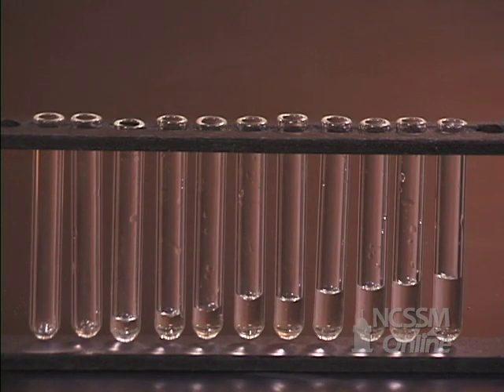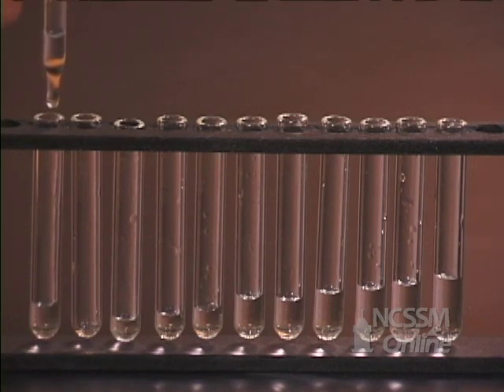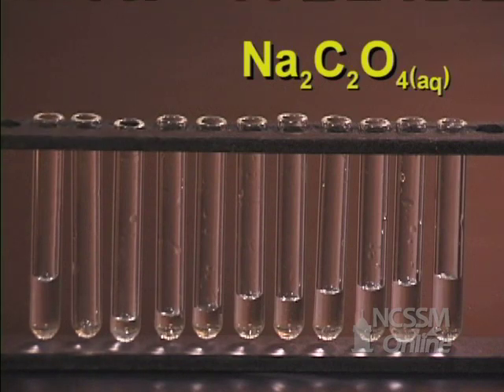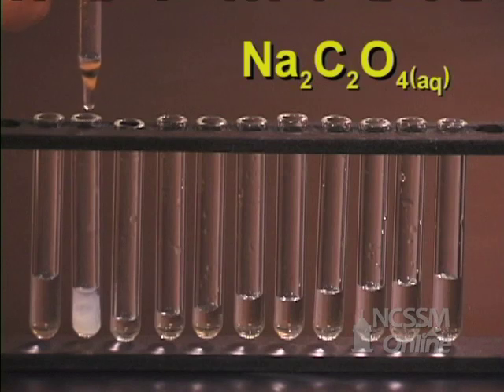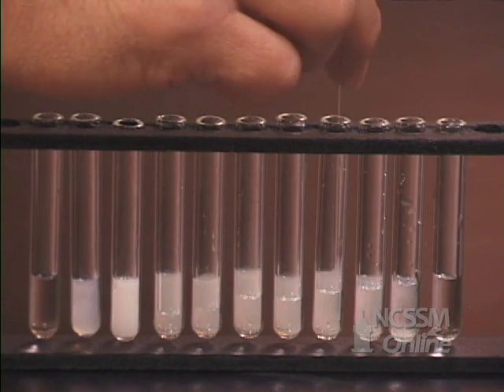We will now add sodium oxalate to each one of the test tubes. We want the total volume of each solution to be constant, so we will make sure that the total number of drops in each test tube is ten. We will place ten drops of sodium oxalate in test tube one, nine drops in test tube two, eight in test tube three, seven in test tube four, and so on.